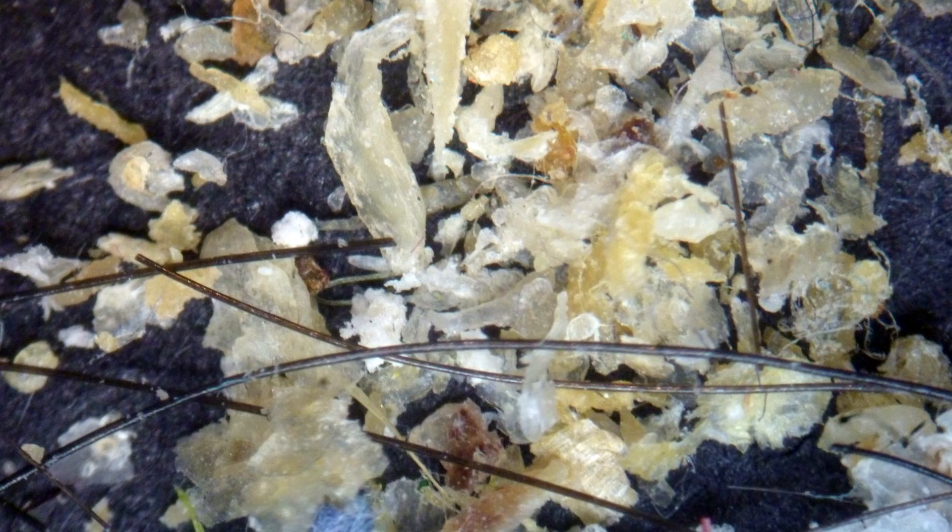Maybe it also depends a little bit on the thickness, and the slightly reddish dandruff flakes could contain maybe a little bit of blood as well. The hair looks like wires. This is all quite fascinating to see everything a little bit more three-dimensional. Under the stereo microscope you actually do see everything with a slightly stronger impression because you actually see it in a three-dimensional way, something that you cannot see on the computer screen. So this is basically dandruff under the stereo microscope.